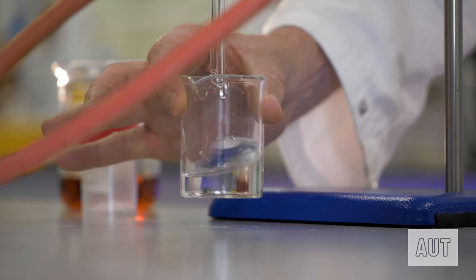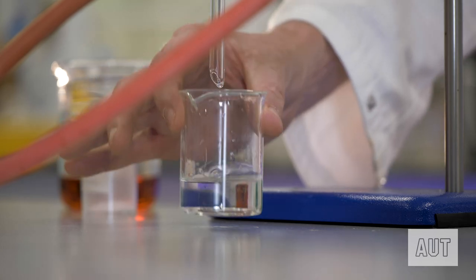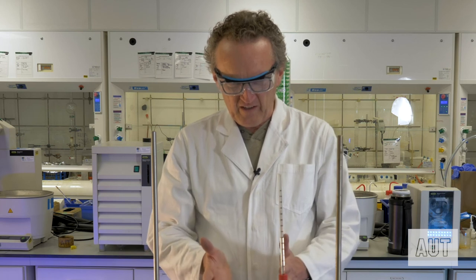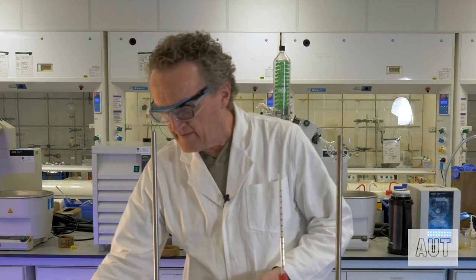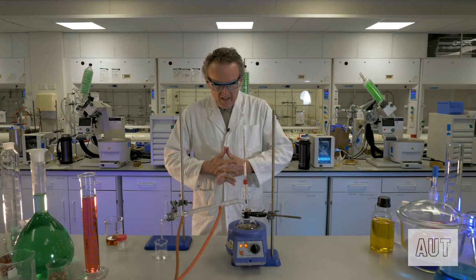You'll notice that the pure liquid is both clear and colourless, and that's our product. So we've achieved what we wanted to achieve. Our distillation has turned a solution that was originally this colour into now a clear and colourless liquid.